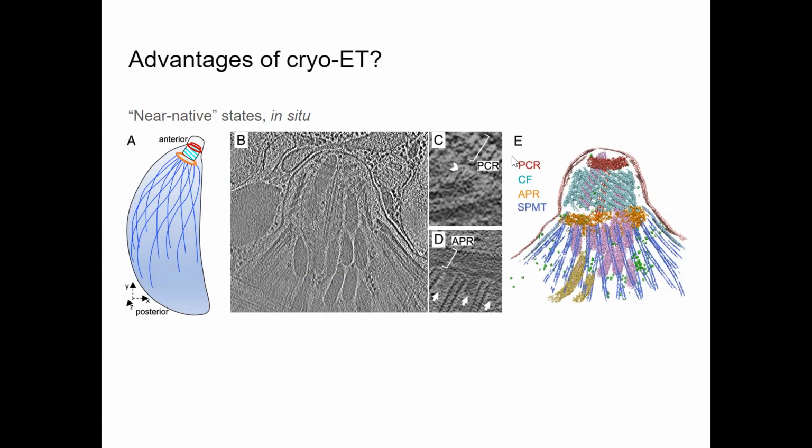For example, imaging of subcellular structures within the context of the cell can provide scientists with more information and a more nuanced understanding of cellular mechanisms. In contrast, X-ray crystallography requires samples to be grown in crystal form, and this can be really challenging since some particles will not readily form crystals. Single particle cryo-EM involves isolating and purifying the target protein or structure from the cell and other surroundings. Cryo-E.T allows scientists to study structures within a cell or tissue environment.